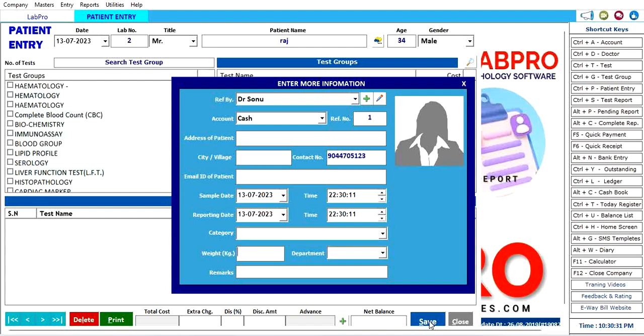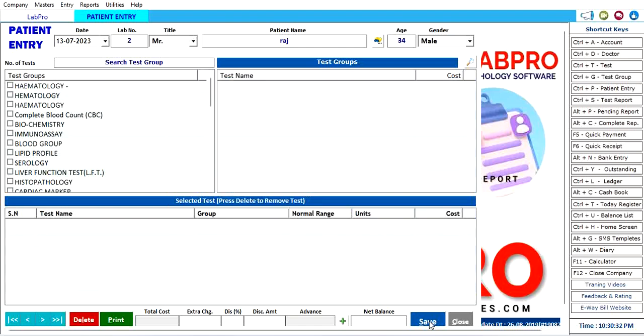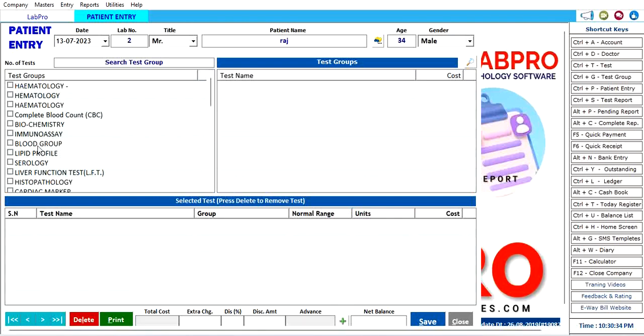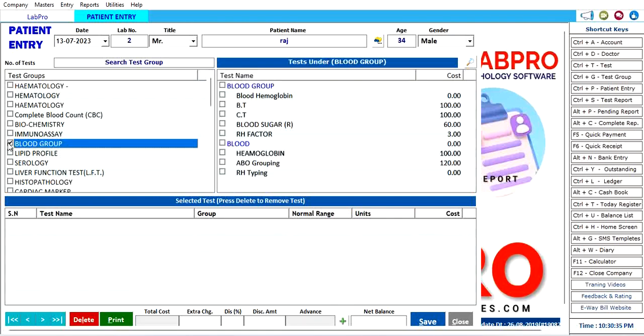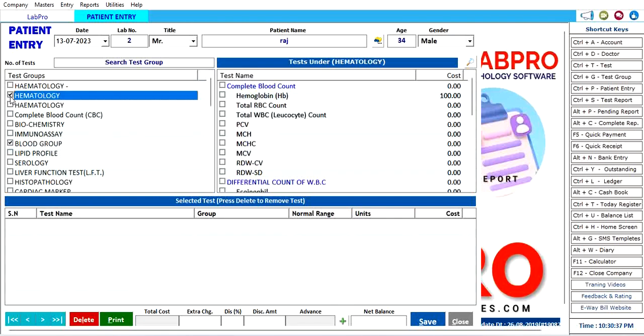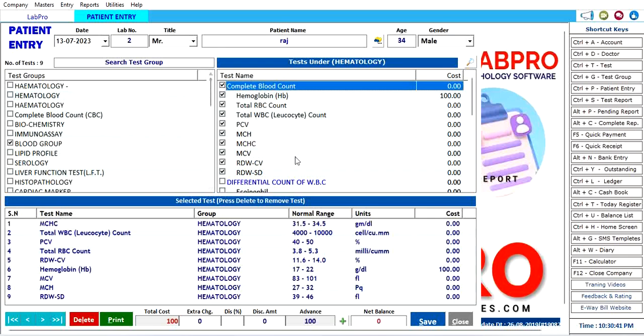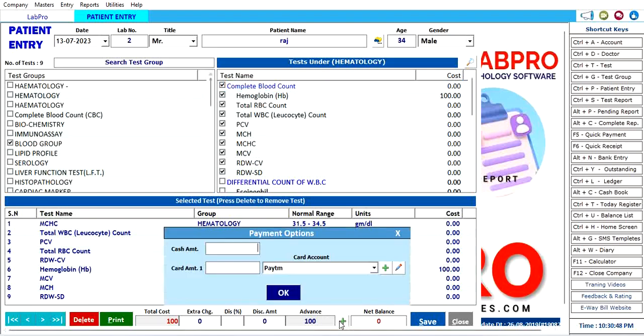Choose the test group whatever you want, like blood group, hematology, whatever. We will choose this Complete Blood Count and all the latest tests updated here. The charge is 100 rupees. We will charge here and just save it.